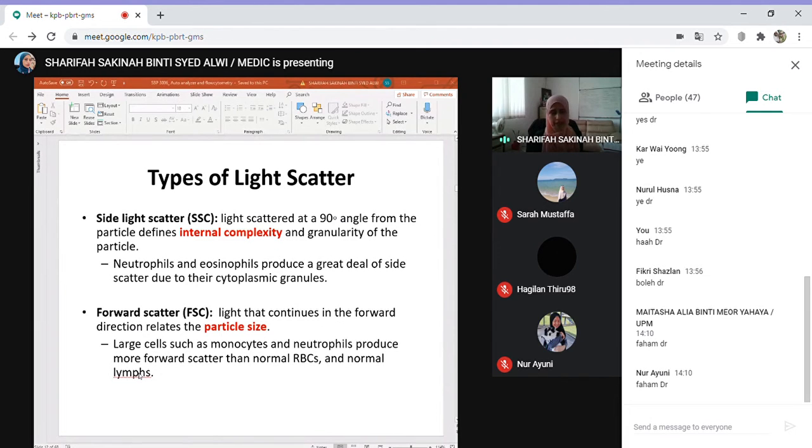It's very tedious and stressful, compared to just having the cells sucked into the Flowcyto, which will do everything for you. But the most important thing is you should know what type of stain to use.